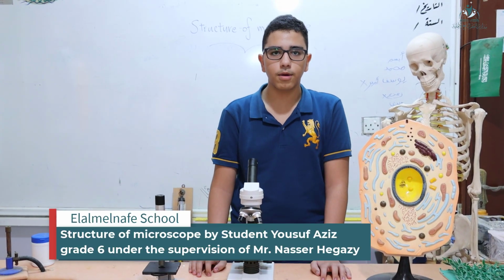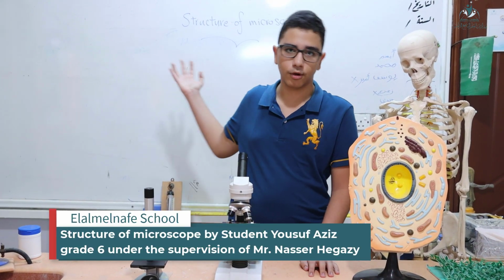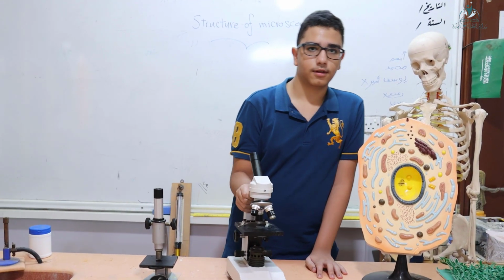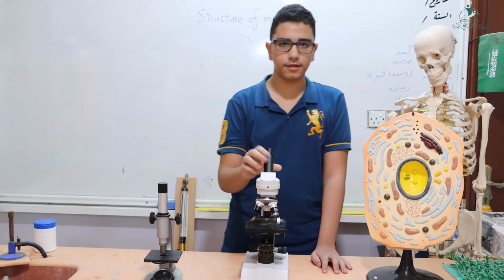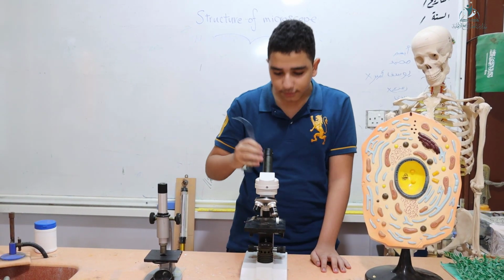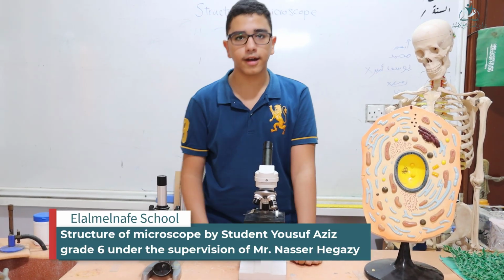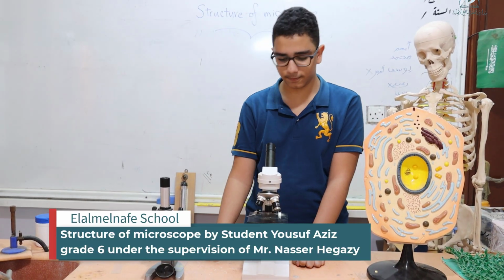Hello everyone. We will now study the structure of the microscope. This is a microscope that we're going to actually use. This is the eyepiece. It allows us to see the sample. This is the objective lenses. It allows us to magnify the image.